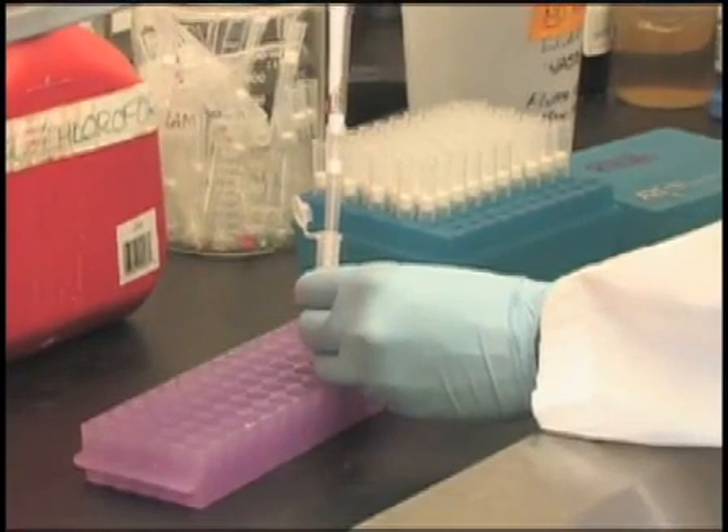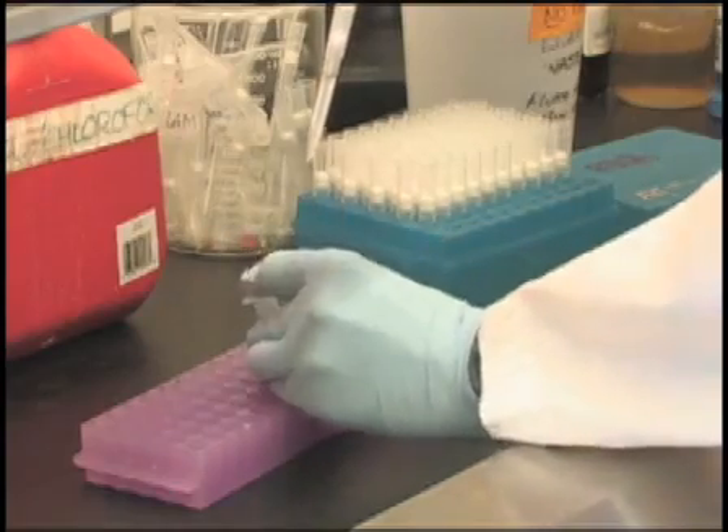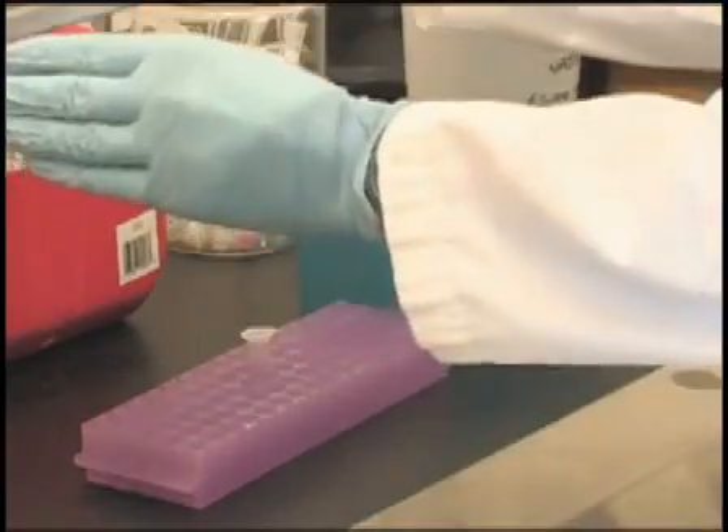Repeat these steps 2 or 3 times until the paraffin is fully dissolved. The tissue should appear wet and soft. It is important to remove all the paraffin to increase the final yield of DNA. Therefore, more washes are required for larger tissue samples.